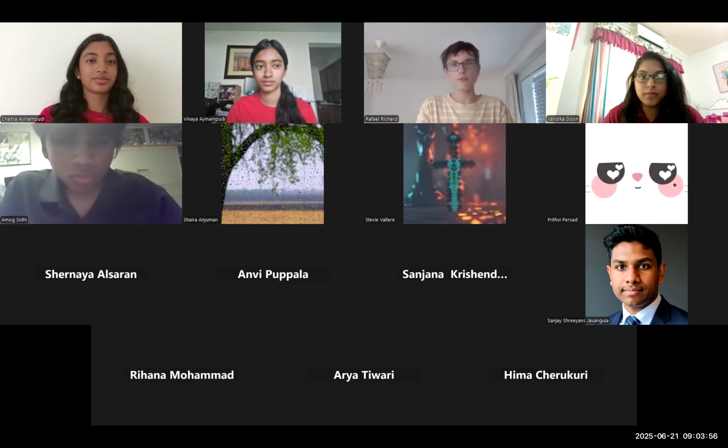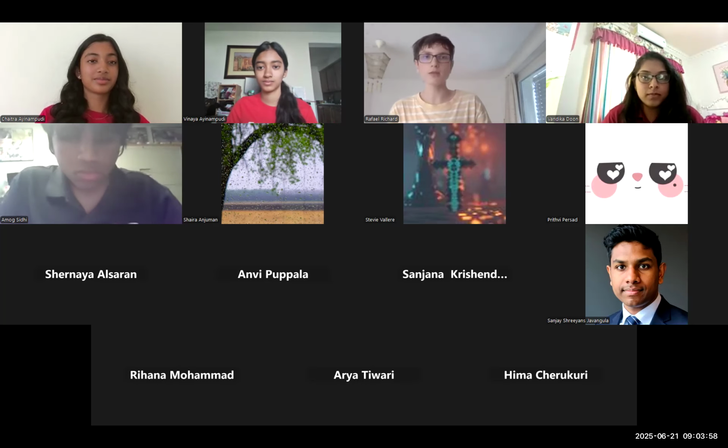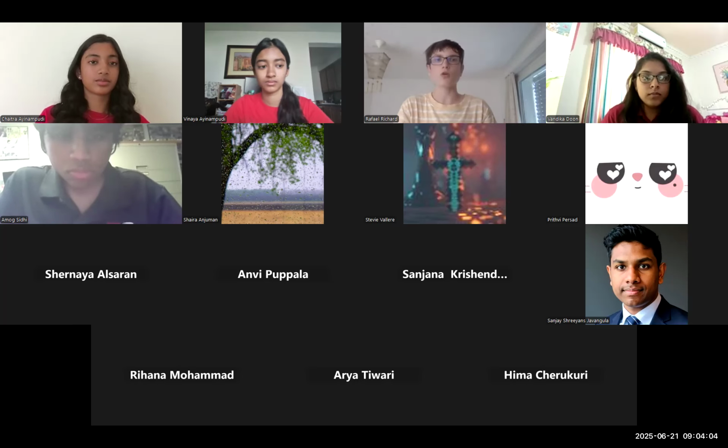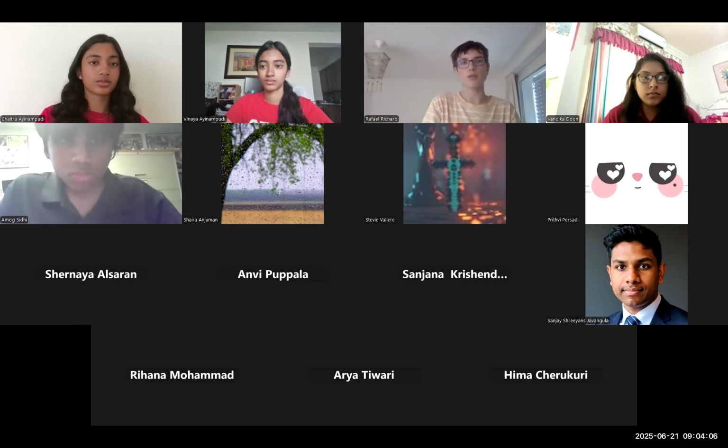Are there different types of plasmids that could be used for this experiment? For example, a pGLO plasmid, or are there any other plasmids that are suitable for this kind of experiment?